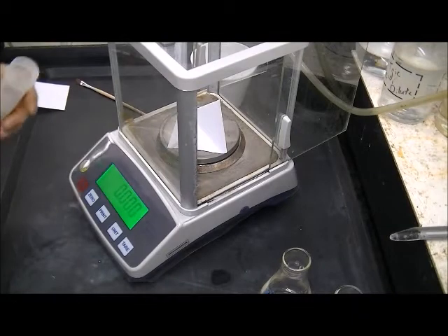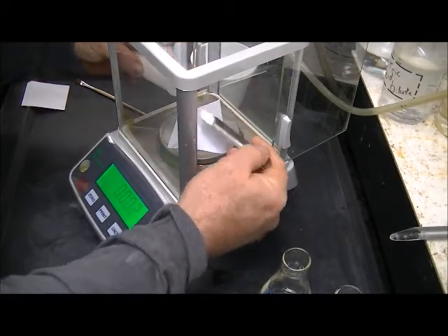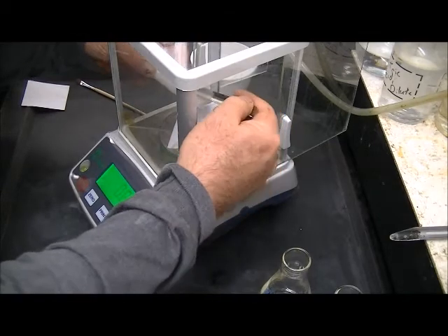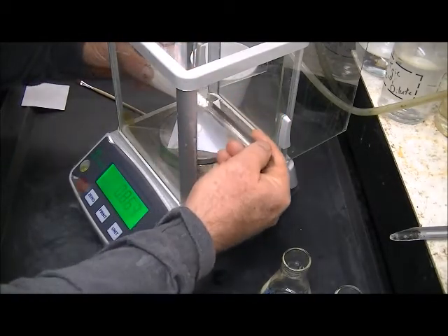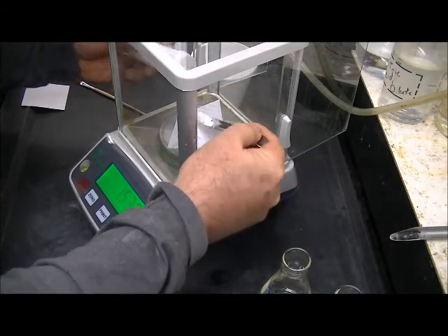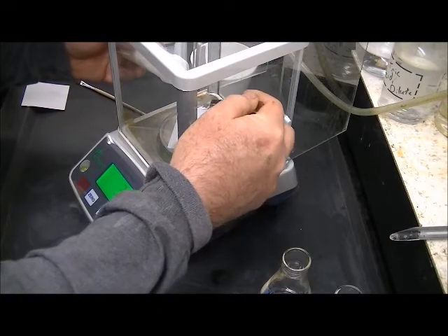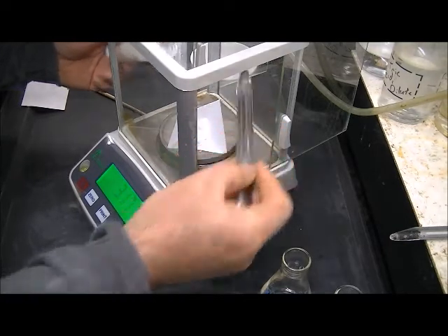This is going to be sample A. And the weighing of the samples is very similar to what we did before. Except that because these are diluted somewhat with an inert powder, we need to weigh more of it. So we're shooting for somewhere close to three grams.